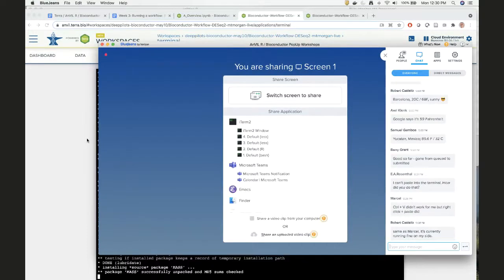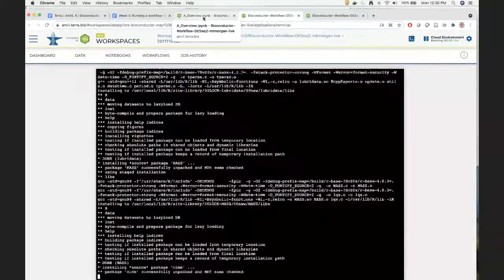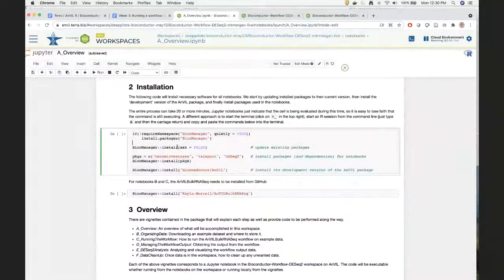Yeah, I can't copy and paste, unfortunately. So what you could do, I think is it Elizabeth? Yes, it's Elizabeth. I think what you could do is just in your Jupyter notebook, press the run button there. I just wanted to make sure it's okay to just run it in Jupyter. Yeah, it'll produce a little output, and then it'll be completely boring for 20 minutes or so, and you'll think that the world has ended or time has stopped. It's giving me some output, so I can see that it's running. Okay, all right, so that's great.